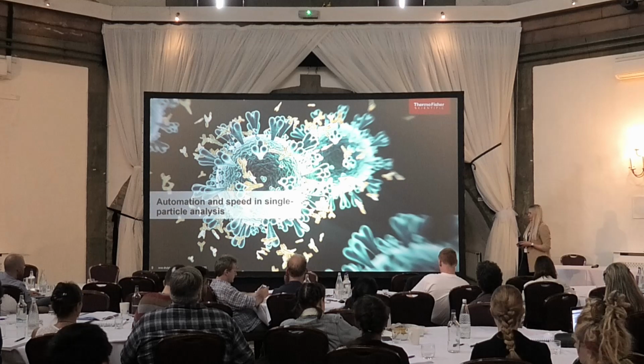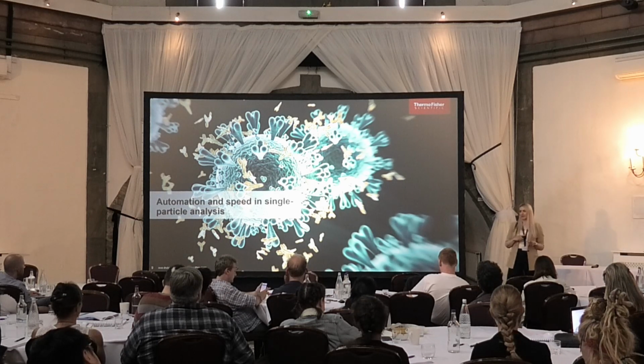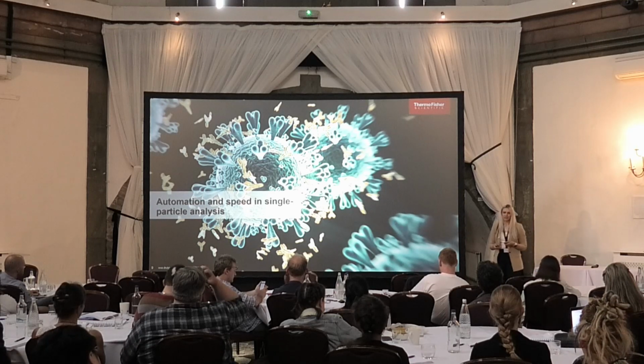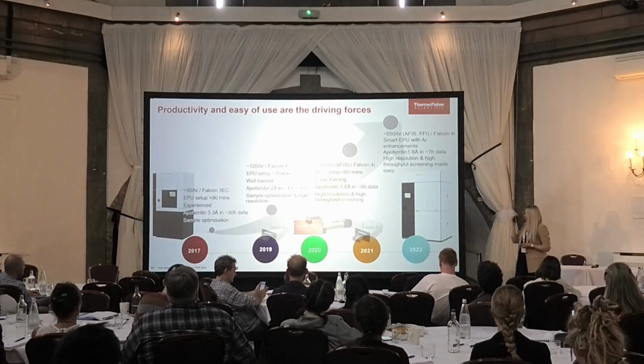So the way we envision single particle analysis, we have to really work on automation and high throughput. We have to move away from this sort of paradigm of one microscope, one user, one sample per 24-hour session, because, yeah. So let me tell you a little bit more about that.